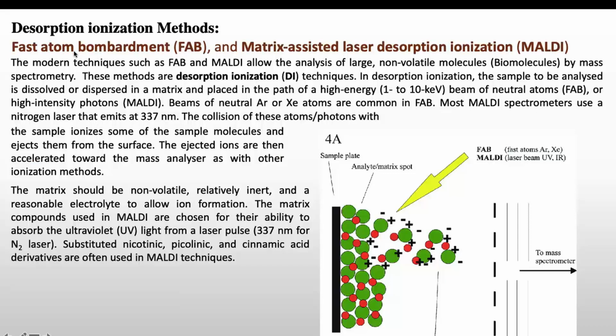Now the fourth technique is the desorption ionization method. There are various desorption methods. Here I am discussing two main methods. First is fast atom bombardment, that is known as FAB, and second is matrix assisted laser desorption ionization, which is also known as MALDI. So modern techniques such as FAB and MALDI allow the analysis of large non-volatile molecules such as biomolecules, and these methods are desorption ionization techniques.